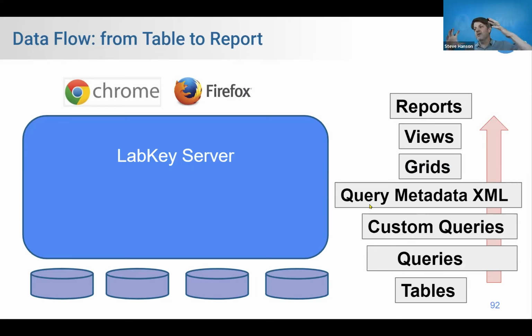Data sets can suck in assays and samples and all that. They're the integration hub of LabKey, so all that data is going to converge tomorrow in a study. We're going to write reports on it. It's going to be very climactic.